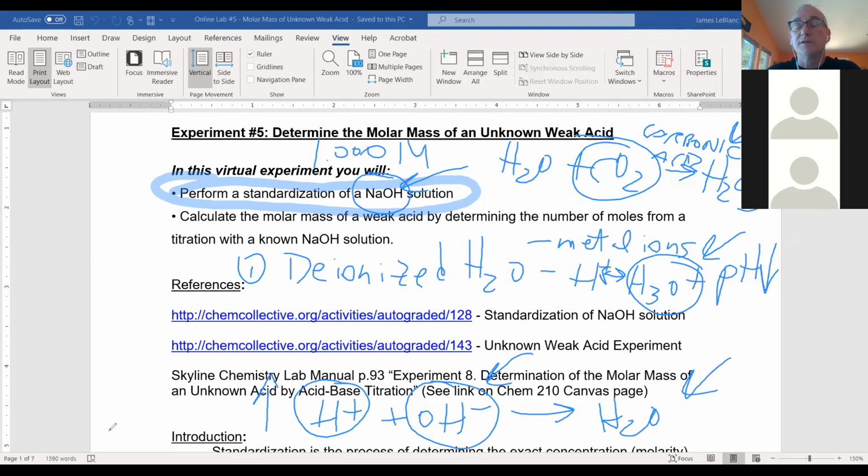An increase? Maybe? Why would it increase it? Can you explain? You figure they would both increase together and form water? Would the pH be lower? Well, the pH is lower than I expect because there's more H plus than I expected because of the presence of CO2. So yeah, there's going to be more H plus than I want. So because there's more H plus in the water, is that going to decrease my hydroxide ion concentration or increase my hydroxide ion concentration?